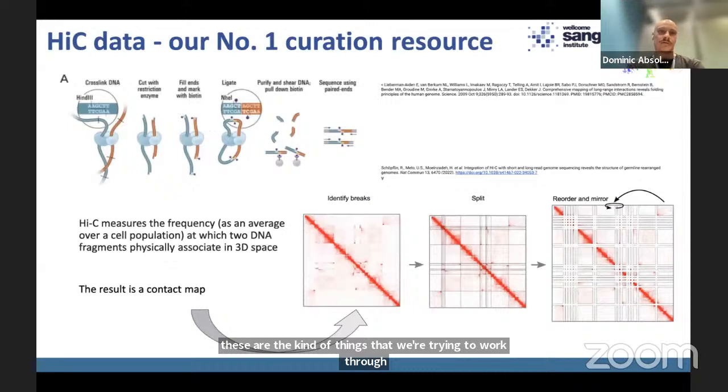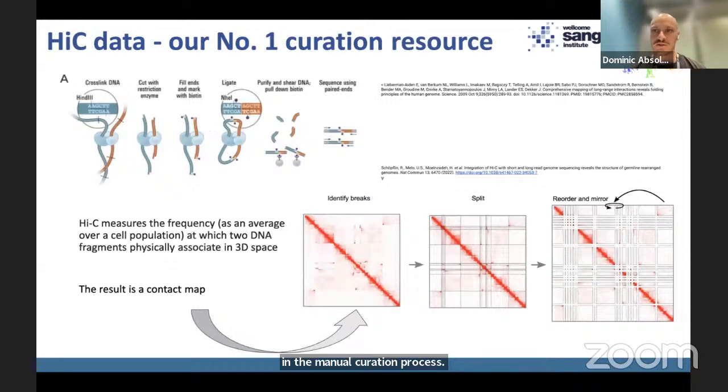So as I said earlier, our number one source of data to perform a manual curation is Hi-C data. It's really, really important. If we don't have Hi-C data, there's not a lot we can do. We just have to trust the assemblers. So for those of you that don't know what Hi-C is, I'm sure most of you do. I'm preaching to the choir.